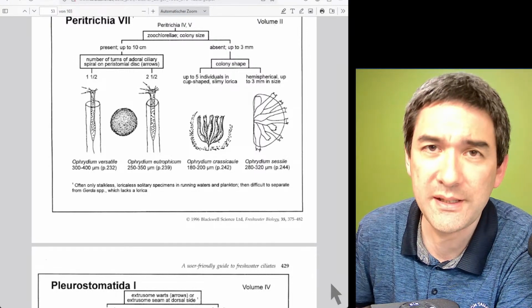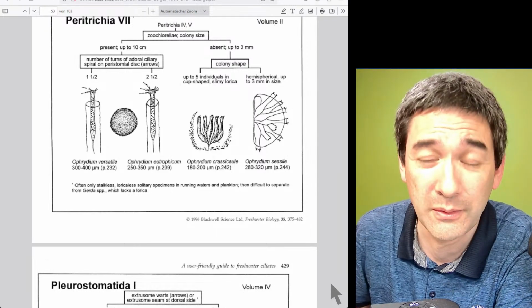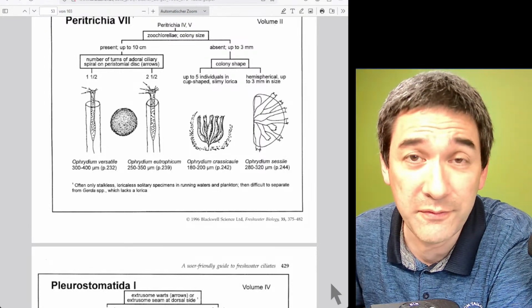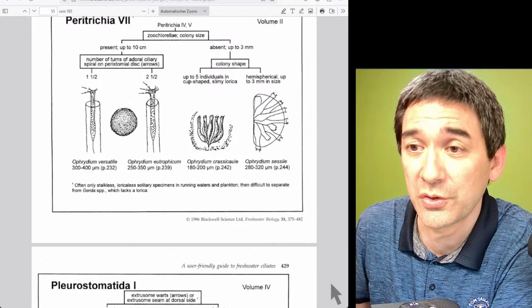Generally, what I would say is do not overthink it too much. Try to get a stable mount together, and it doesn't really matter in most cases whether the dye is stable over the next 50 or 100 years, right? I think that's not so. Yeah, I would say for amateur purposes, not so important.